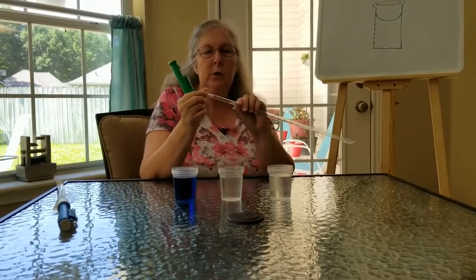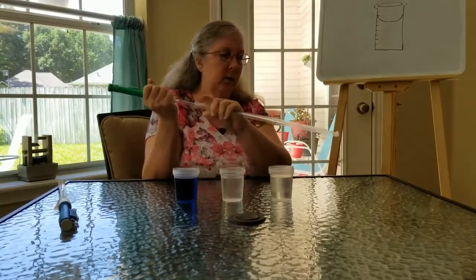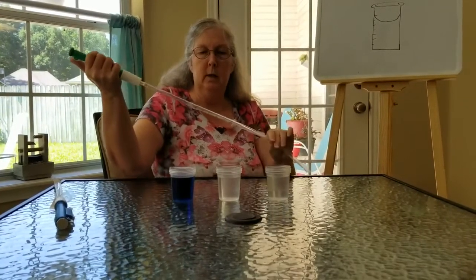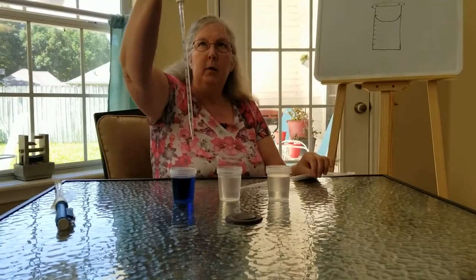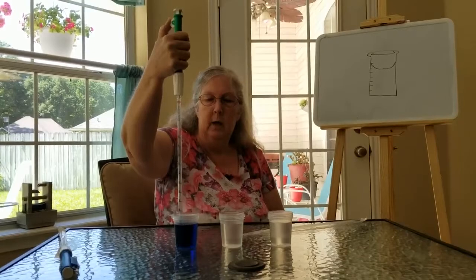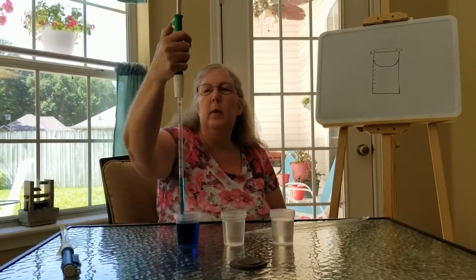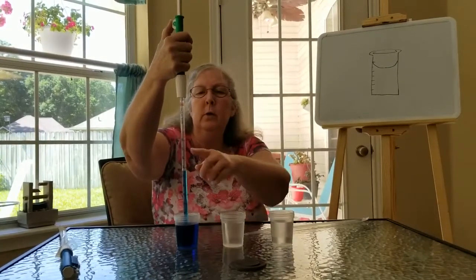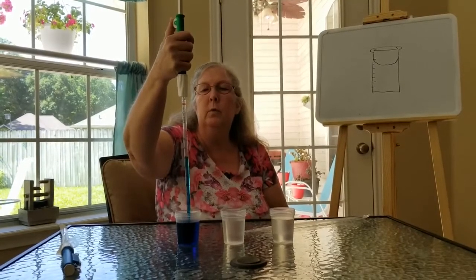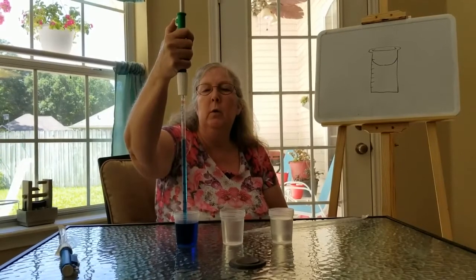So what you would do is just open the package carefully, keeping the tip still in your sterile container. Slide it out. Now with the pipette, there is this wheel here that you just turn, and that is going to draw the solution up into the pipette, as you can see here. Now there are numbers on the side, so depending on how much you have been told to measure, this one is a 10 ml pipette, so if you were told to measure 10 milliliters, you would bring it all the way up.